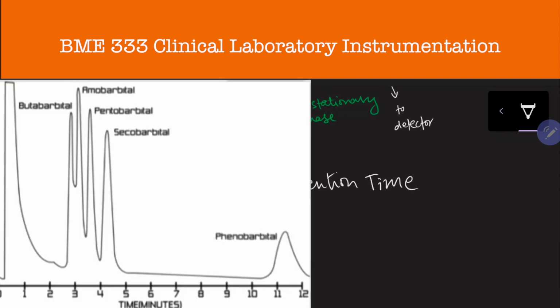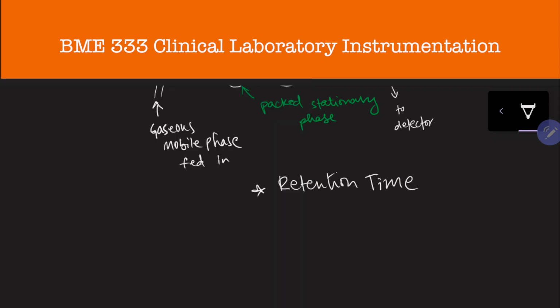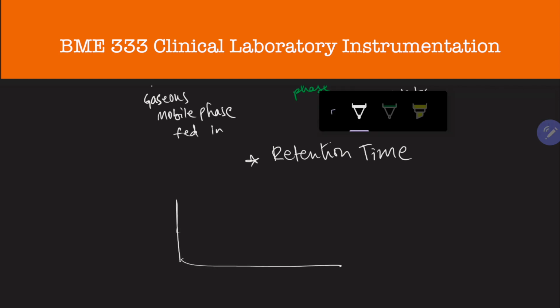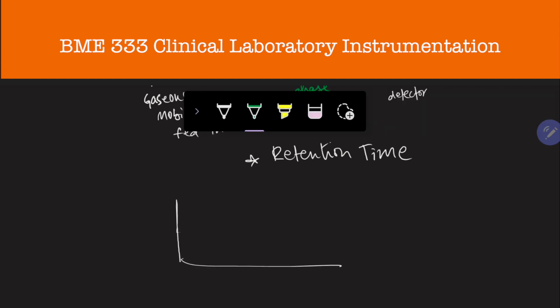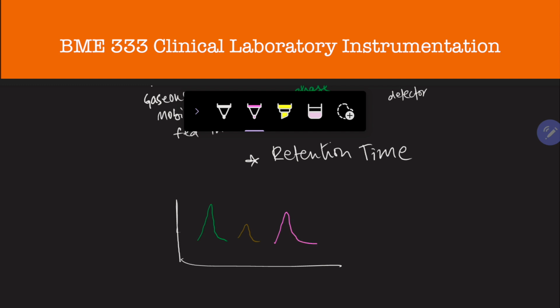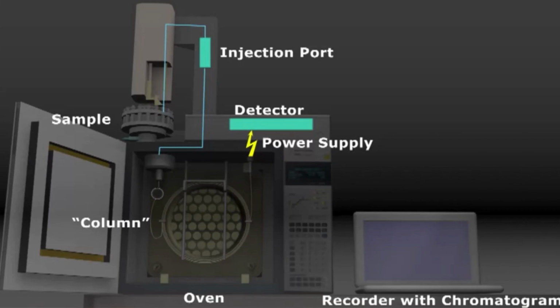When it comes to which technique you should be using, it depends on your compound and on the mixture that you've got, because, as you'll see in the video as well, there's an oven and a lot of heat involved in the setup.